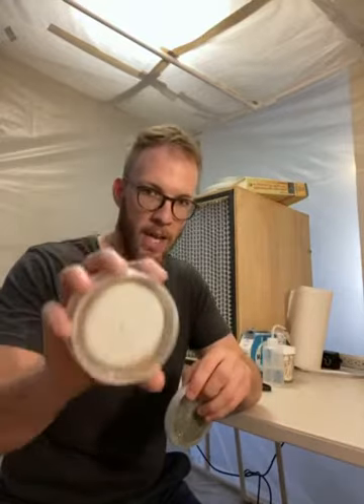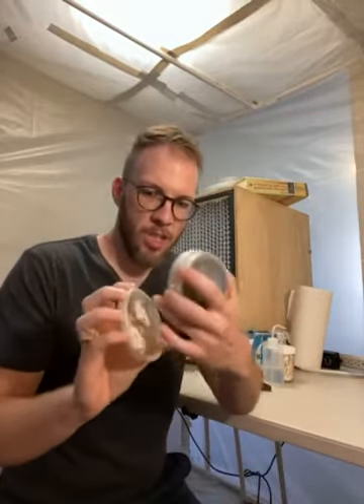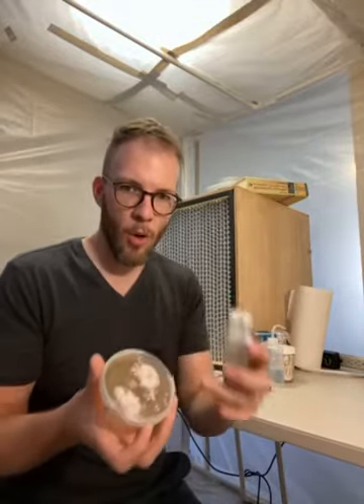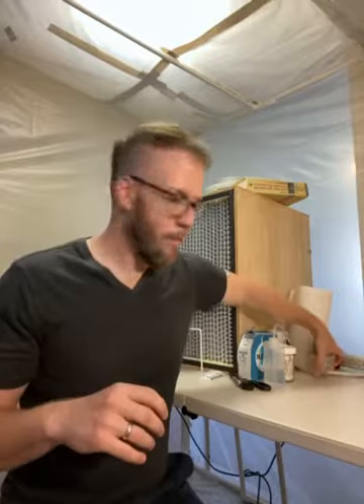There are a lot of different kinds of molds that look like white growths on a plate — that's called morphology, the shape and size of the mold. We have to dig in a little bit more to figure out exactly what these organisms are, and that's where fungal microscopy comes into play. There's a whole set of skills needed to take a small piece and look at it under the microscope to identify key characteristics of the organism.